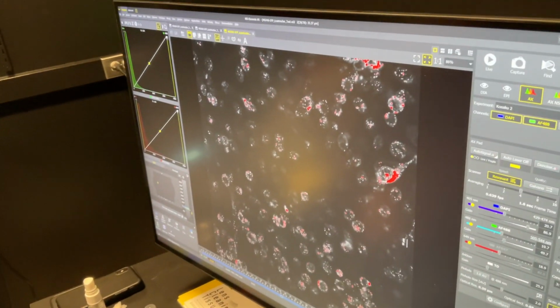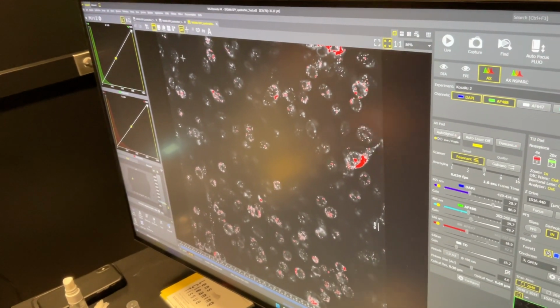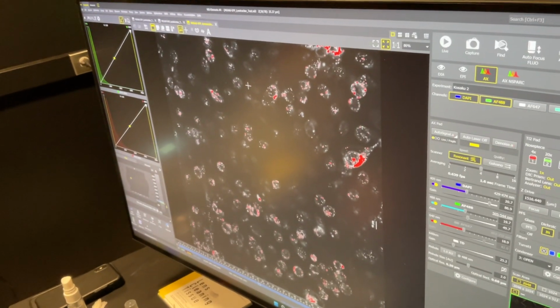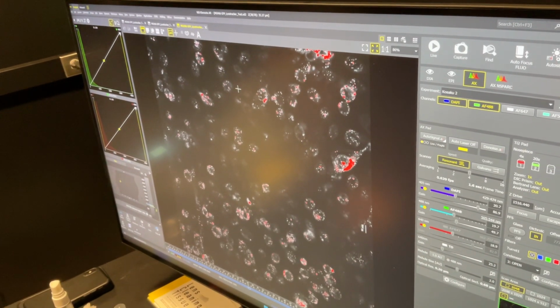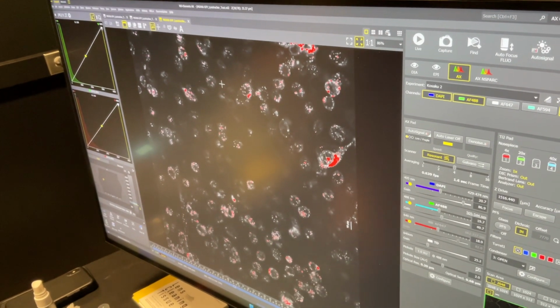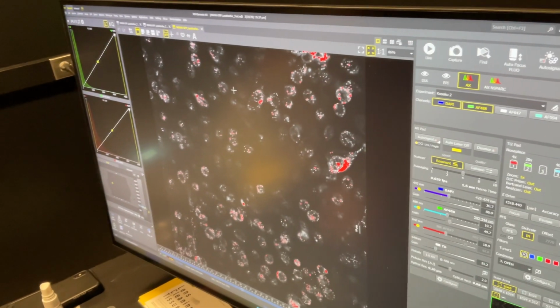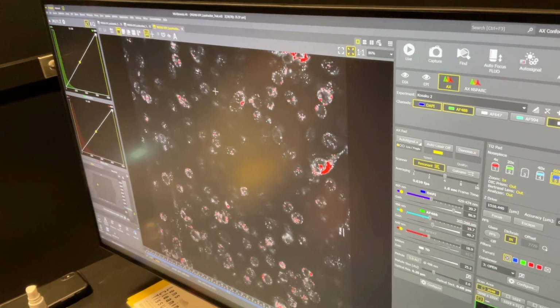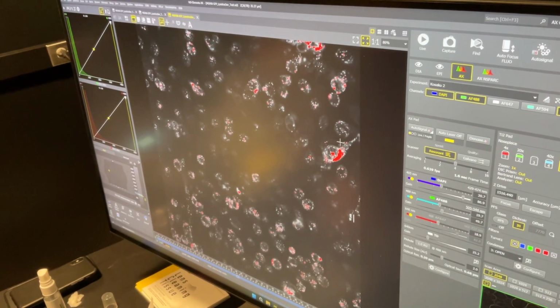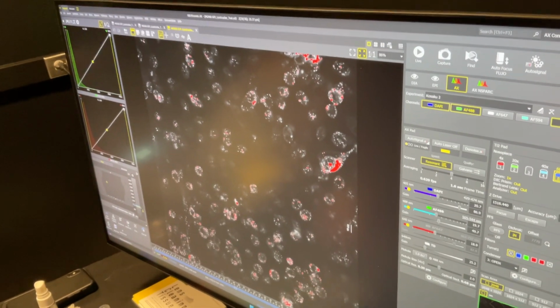I think this image was before the training. Well, we were trying. With the zebrafish, there's some part with the far red that's staining some other tissue that I don't care about very brightly. So sometimes I have to crank it up to get it. Exactly, and that's exactly what you should be doing. But no, I think we were just figuring out the machine too when we took these images.